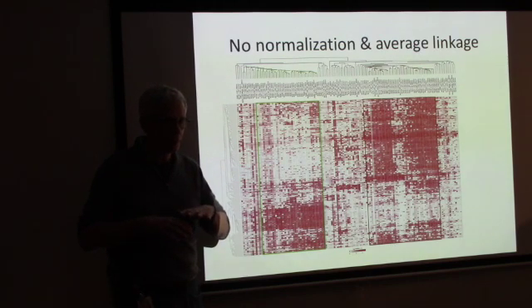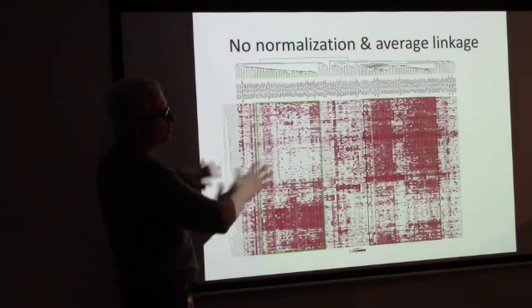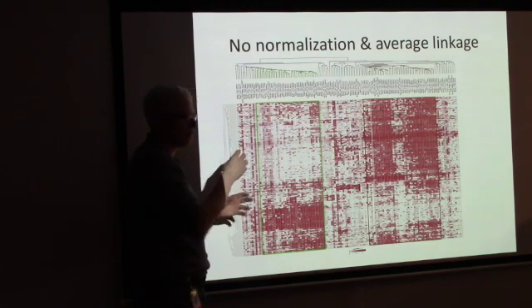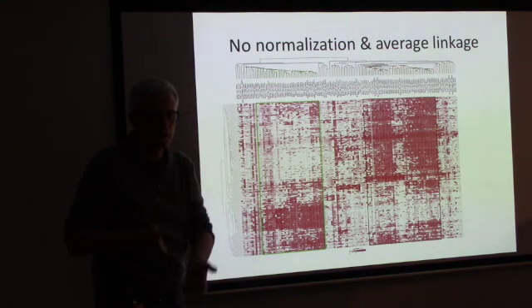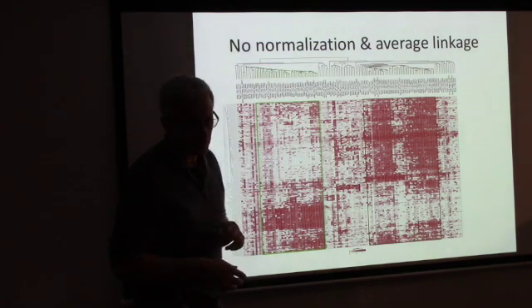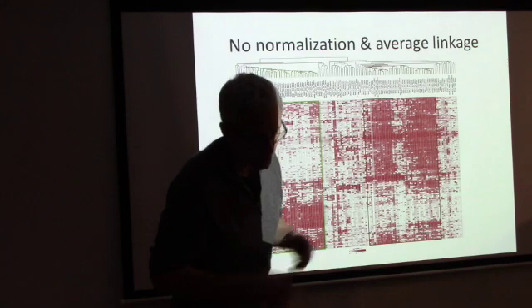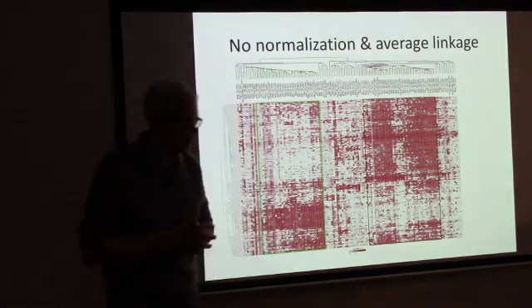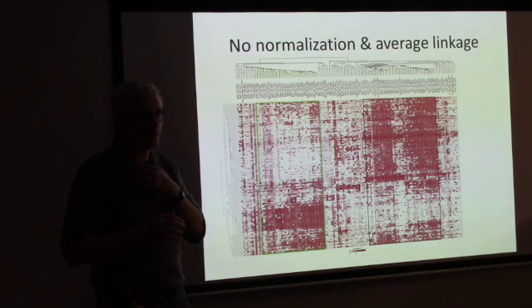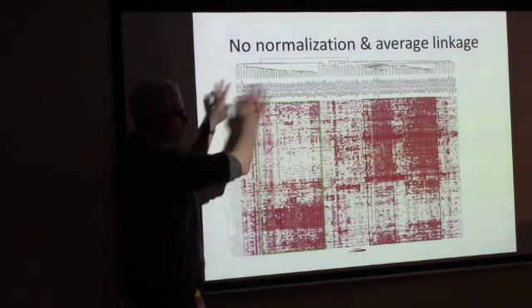So instead, what is popular in that case is to use some technology to take all your samples and try to throw them into a two-dimensional picture, so that the samples that have a similar gene expression profile will be near each other on the plane. And a popular way to do that is called TSNE, T-S-N-E. So I just thought I'll throw that out. That is another thing that is now quite often done when you have thousands of samples, is you use TSNE to just lay them out in 2 dimensions.